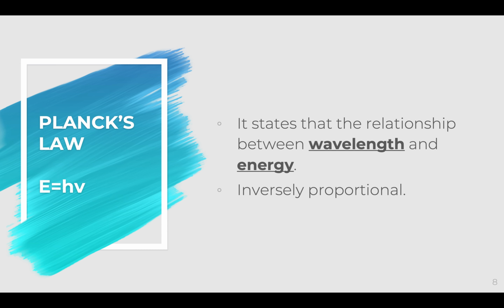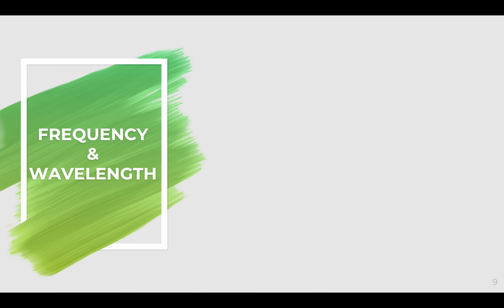Because later on, when we go deeper into spectrophotometry, you will realize that we are not just measuring your white light or your light itself. We are measuring a specific wavelength, a specific light coming from the spectrum of your light. That is the reason why we call it a spectrophotometer. So, frequency and wavelength. Let me differentiate the two for you first.